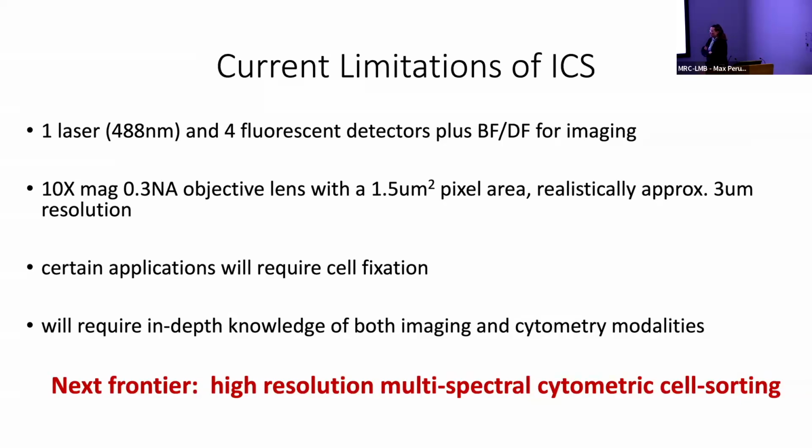So we're hoping to increase the resolution that's currently available on the market, but also most importantly, we are hoping to include the ability to do more than one fluorophore. And that will really be key to push this technological development forward, where we're able to potentially mark more than just one organelle, but maybe up to 4 or 5 simultaneously, and get better resolution as well. So yeah, it's really exciting times, I think, in the community.